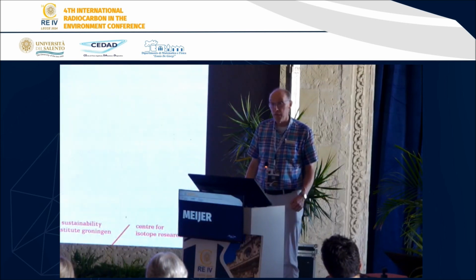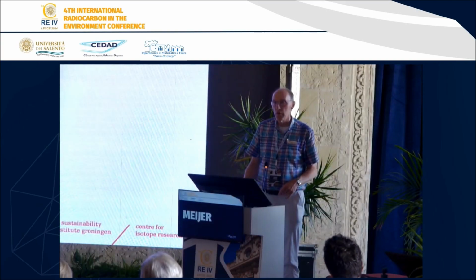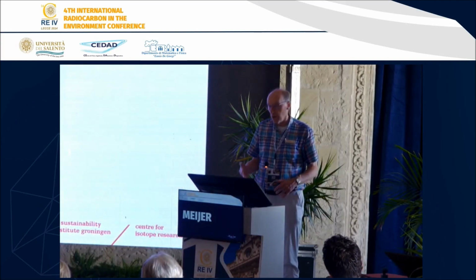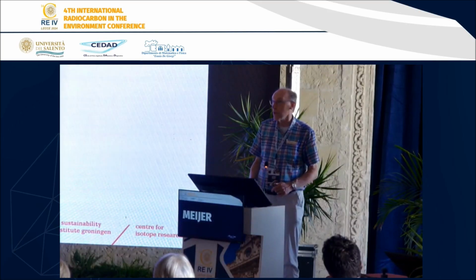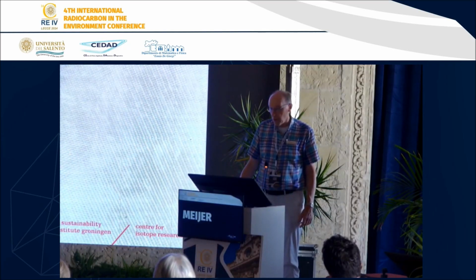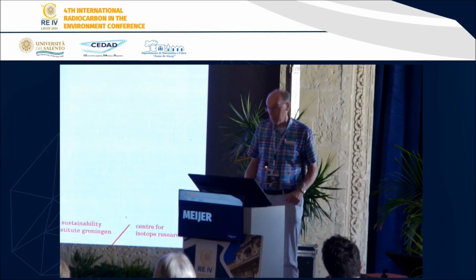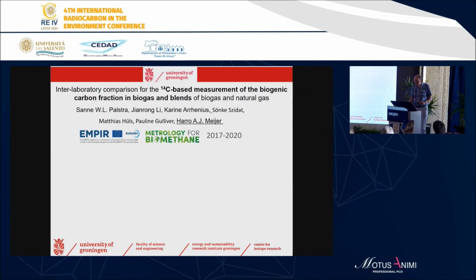You have to pay if you bring fossil CO2 into the atmosphere, but not if the CO2 can be pointed to be of biogenic origin. So this is no longer just a scientific effort, it also has to do with economy, and as soon as economy comes into play, you need standards and you need legal things and so forth. So this whole metrology for biomethane also had those aspects. But we, as simple radiocarbon people, didn't care too much about it and just wanted to see what we could do finding the percentage of biogas in a biogas natural gas mixture. So I will show a bit of this, the background.